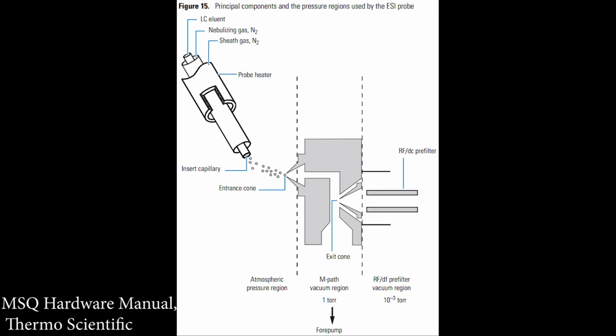Because it's not trivial to go from 760 torr to 10 to the minus 5th torr. This is sort of like trying to go from a fire hose to a trickle. It's a lot easier if you have intermediate steps to cut down on that rush of gases flowing in from ambient atmosphere. You gradually cut it down until you get down to 10 to the minus 5th or 10 to the minus 7, where you don't have much air or atmosphere left at all.